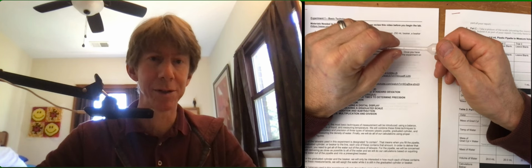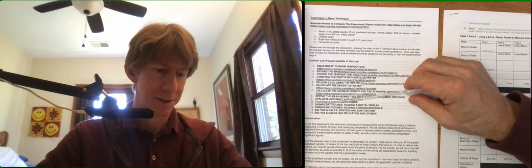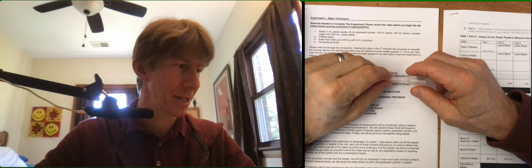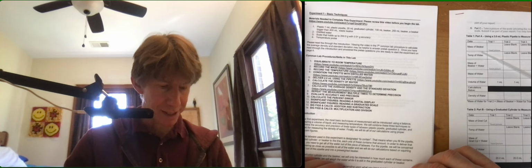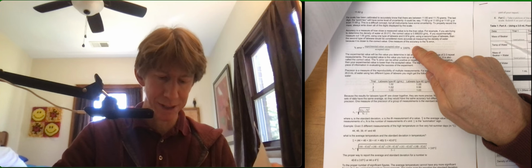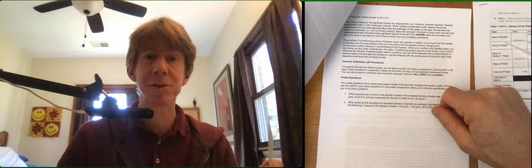And we're going to be doing both of those for the pipette, the graduated cylinder, and the beaker. I forget which beaker it says, maybe the 250 mL beaker, well, we'll figure that out when I get there. I've got all these beakers here. Okay, so I've got all my materials, and I've read over the introduction personally. You'll notice that the introduction has the percent error calculation built right into it, an example of how to do it and what it means, and then the standard deviation, an example as well. Including how to do significant figures.